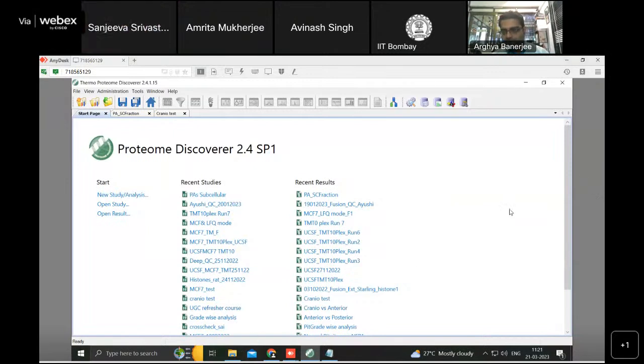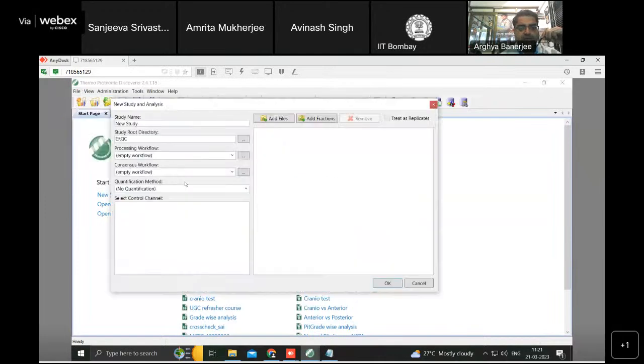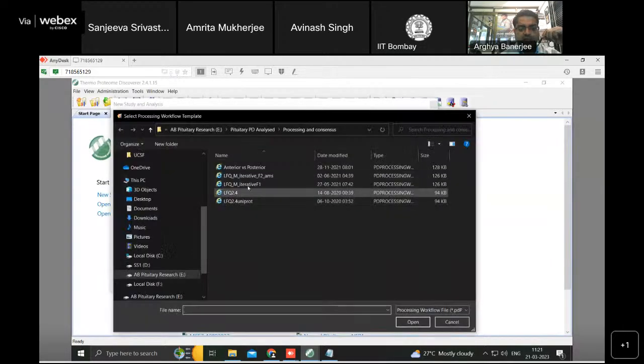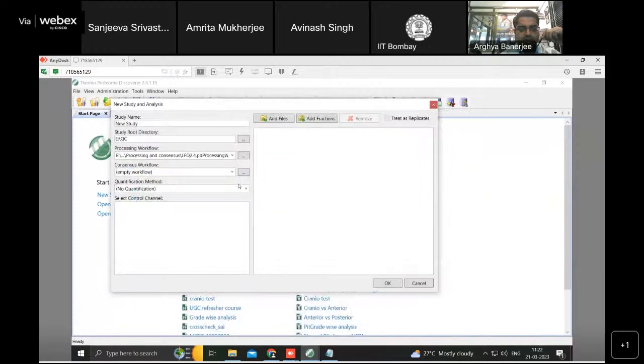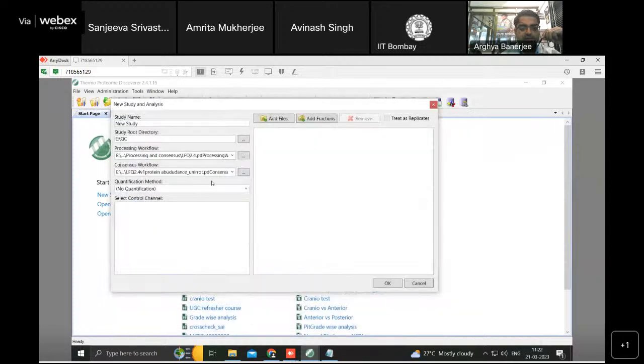So my voice is audible, correct? Yep. Okay, great. So this is one of the robust proprietary tools which is owned by Thermo. So Proteome Discoverer is one of the robust tools which we use. So I will just give you a brief. You can initiate a study by going to File and opening a new study. When you are doing a new study, you will be getting the workflows. The two important workflows are the processing and the consensus. So I will just add the processing and the consensus workflow. How the processing and consensus workflows are set may be a discussion for some other time. So yeah, I have added the processing and consensus workflow.